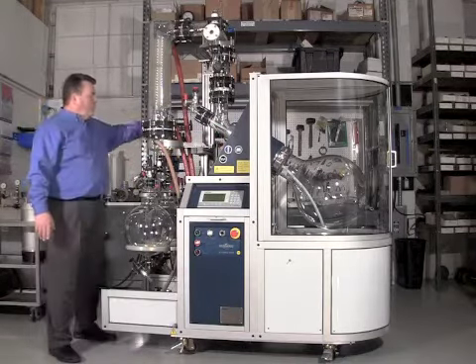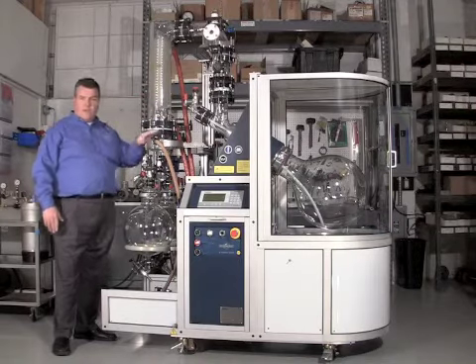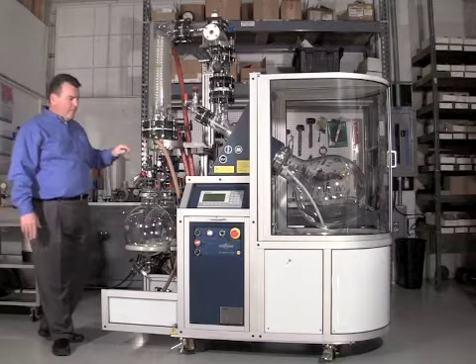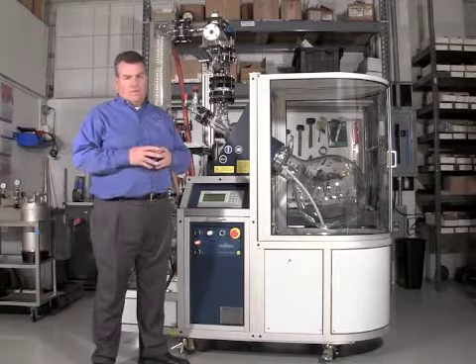We have here hosing for the glycol or coolant fluid that goes into the condenser. This is how the vacuum is applied to the unit. It's on wheels so it's portable, and it's also designed with a tremendous amount of safety features.